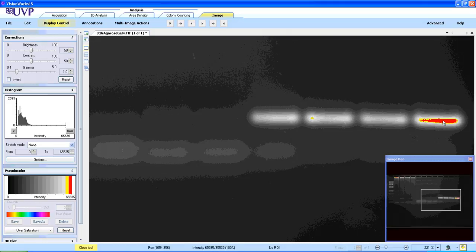it's above the values for measuring that. So that's fine. That gives us an idea that all of these bands here are measurable and this one is not. So we can go ahead and turn off the saturation, keeping in mind which band we don't want to measure.